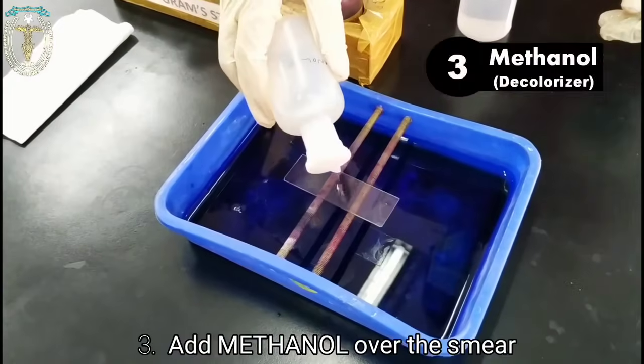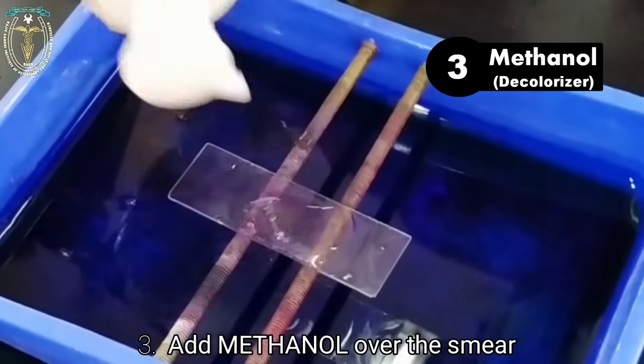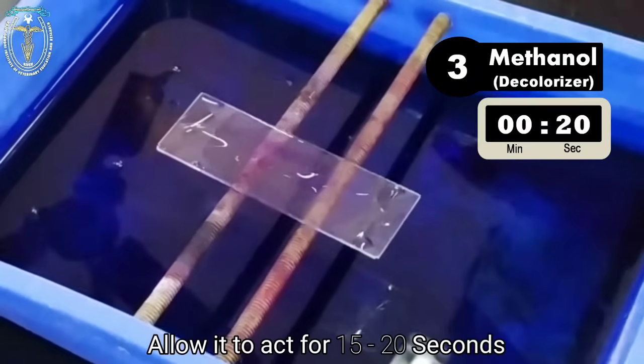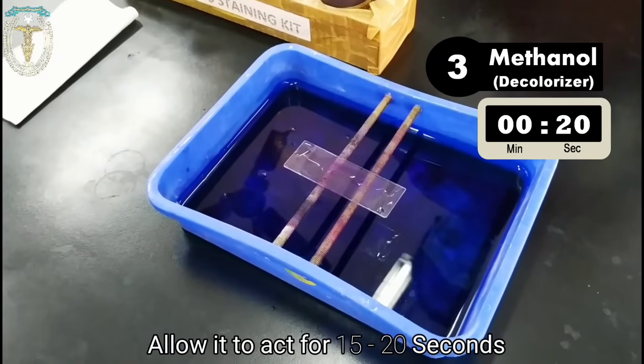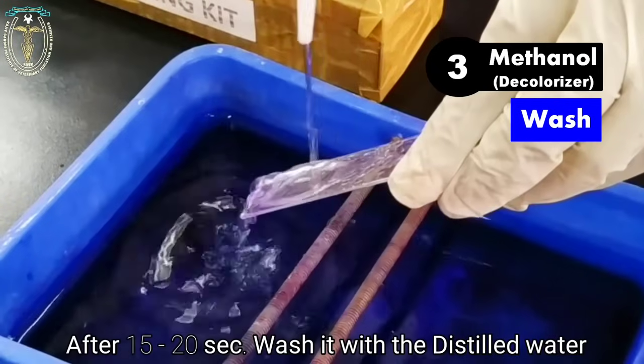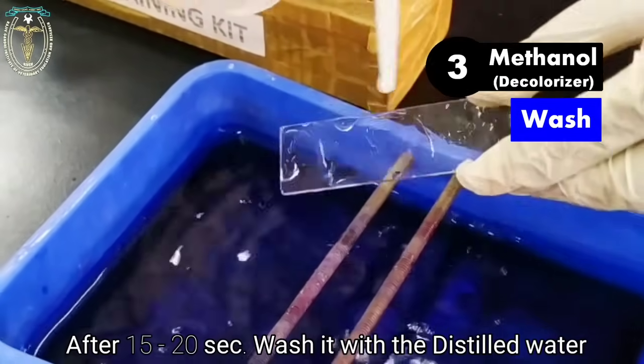Thirdly, add the methanol over the smear. Cover the entire smear with the methanol and allow it to act for 15 to 20 seconds. After 15 to 20 seconds, wash it with the distilled water.